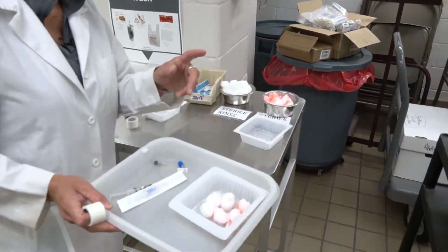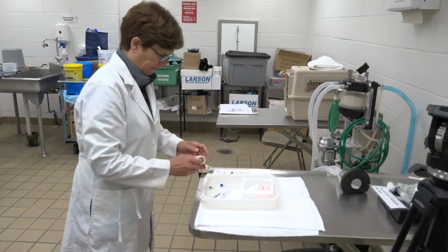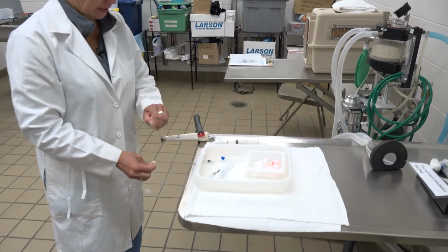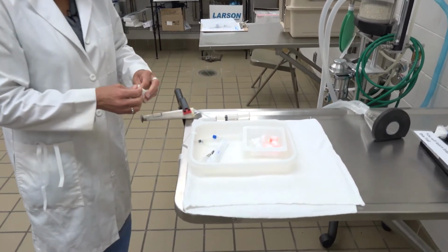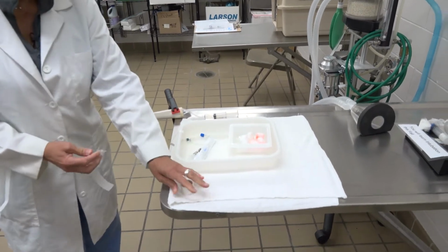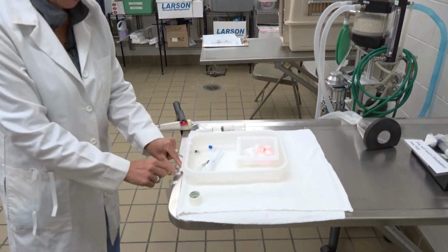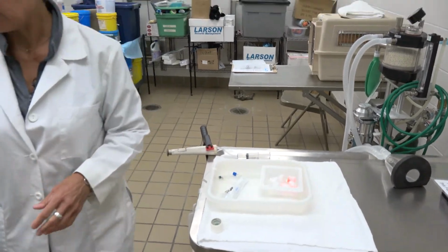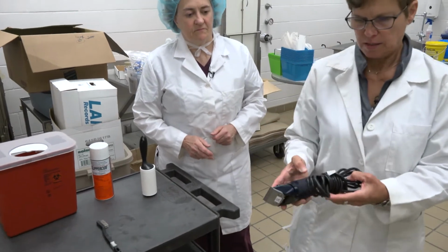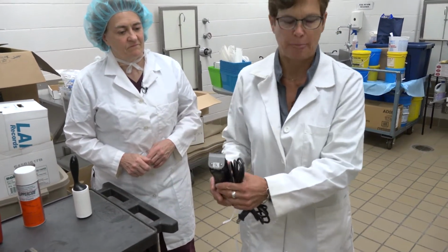We'll go to a table here. I'm going to rip my tape, and for our dry run, we're going to have things a little bit differently than in the real lab, but I'm going to go over and get some clippers. These are shared items, so remember that when we're finished with them, we want to clean them and put them back where we got them.